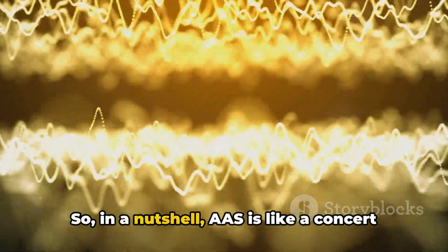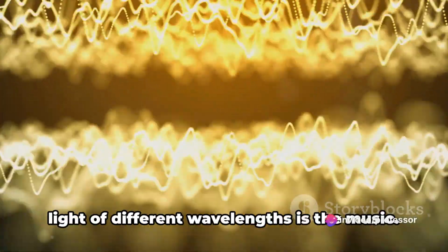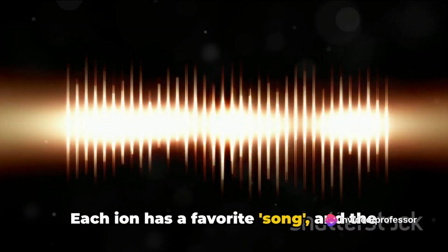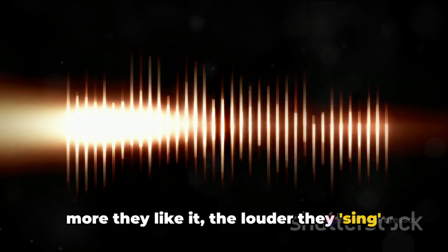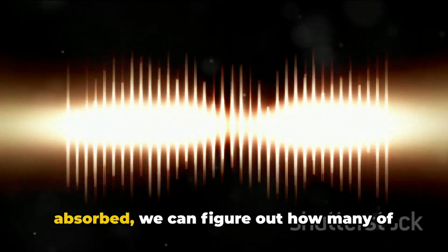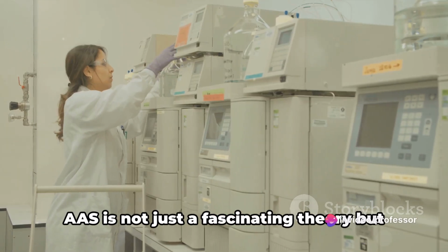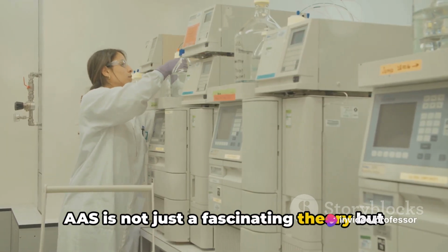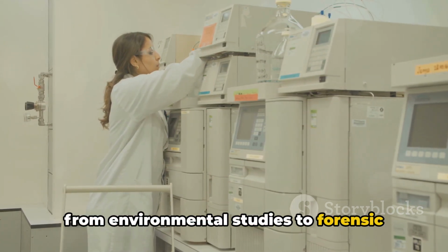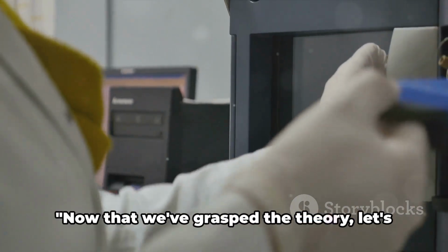So, in a nutshell, AAS is like a concert where metallic ions are the audience, and light of different wavelengths is the music. Each ion has a favorite song, and the more they like it, the louder they sing by absorbing more light. And by measuring how much light is absorbed, we can figure out how many of these fans are present in our sample. AAS is not just a fascinating theory, but a practical tool used in various fields, from environmental studies to forensic science and, of course, pharmaceuticals. But we'll get into that later.